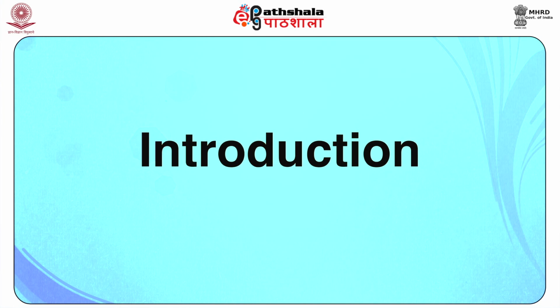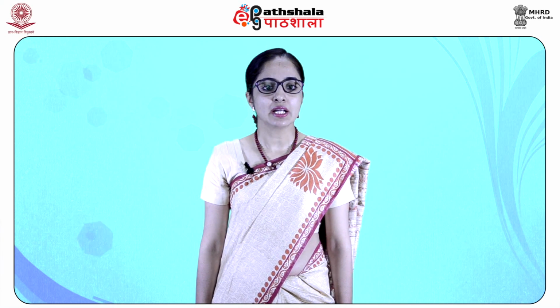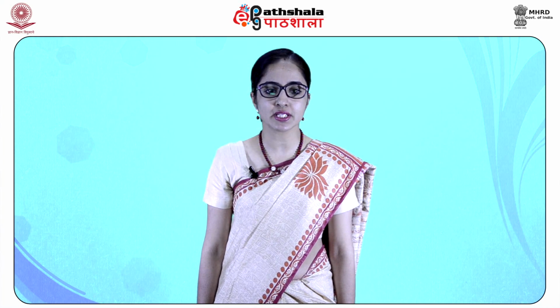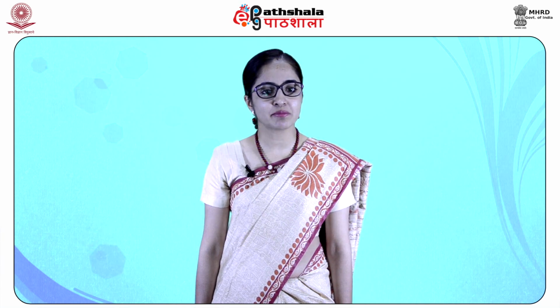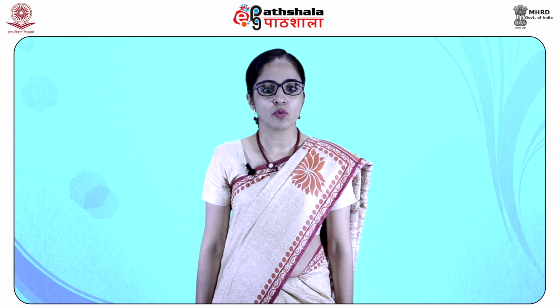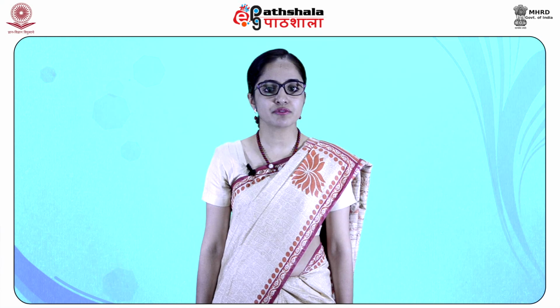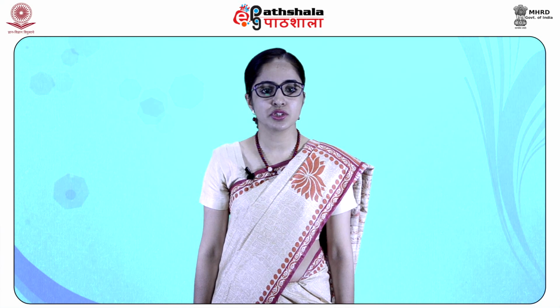Now let us introduce this module, which deals with instrumentation of NMR and sample handling. Continuous wave and Fourier transform are two general types of instrumentation in NMR spectrometers. Initially, experiments were carried out with the help of continuous wave instruments. However, in 1970, the first Fourier transform instruments were built. Since then, NMR spectrometers dominate the market.